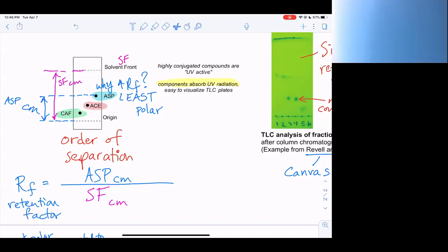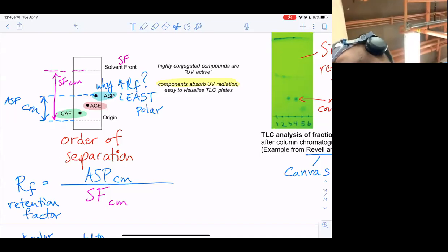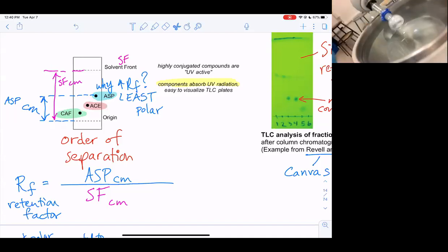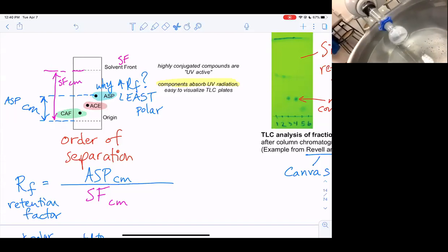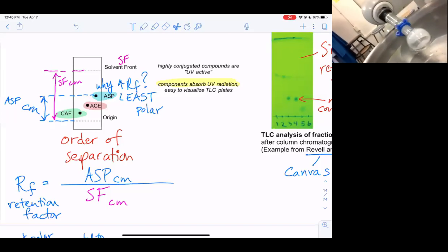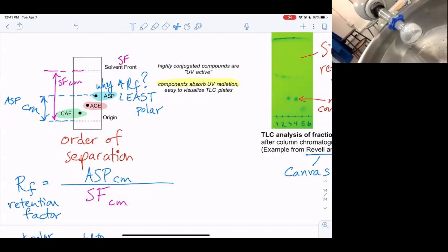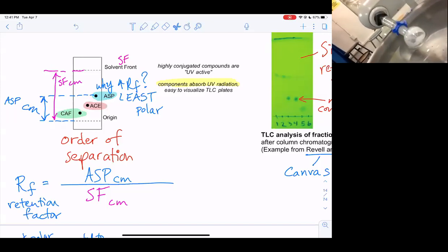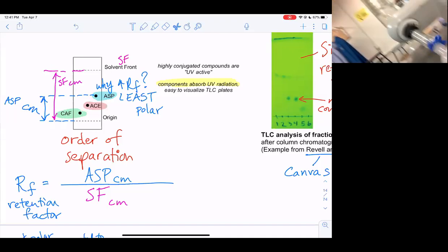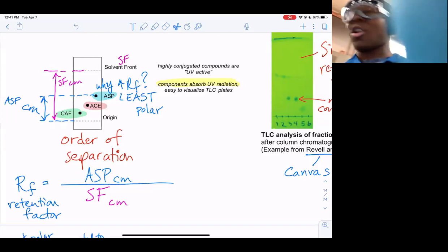All right. Can you guys hear me? Awesome. That hood is so loud. But so we now have nice little pretty white crystals. That's the silica gel bound to our three compounds. Maybe a little insoluble impurity that I kind of let through at the end there. So I turned up the vacuum to make sure it gets really, really dry, make it easier for Avery to get out. Silica gel can be a pain sometimes to get out of a flask if it's not really dry.